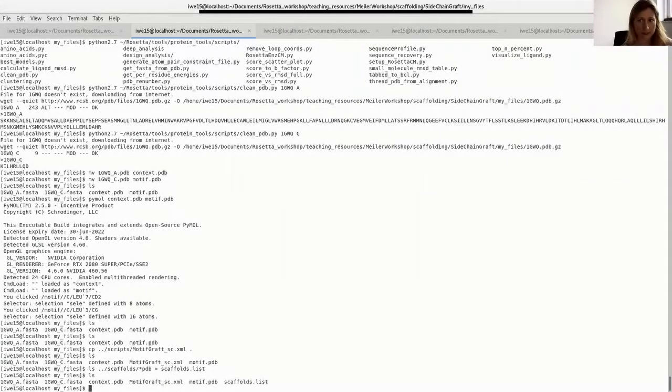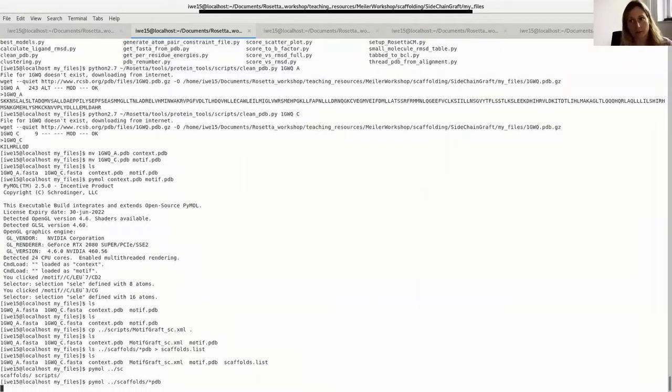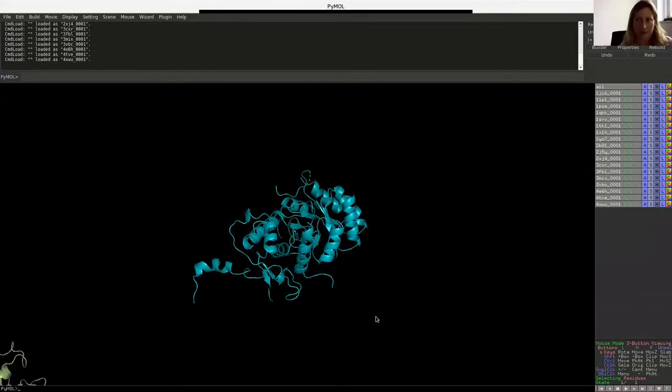Let's take a brief look at the scaffold library we provided you with, because this is actually interesting. Your scaffolds are actually like an integral part of these protocols. Selection can really make or break it. If you have good scaffolds, you're gonna find something you can graft on. If that is not well prepared, it might be very hard to find a matching scaffold. However, there are options to run, like to iterate over the whole PDB and find scaffolds. Let's just align them onto one.